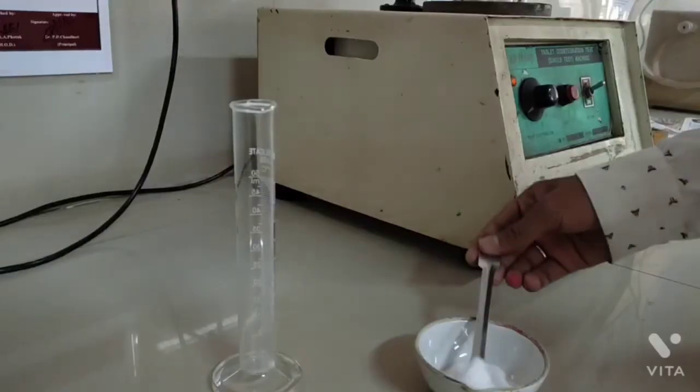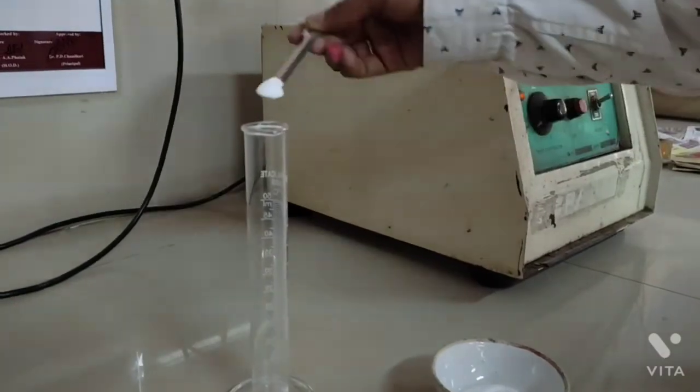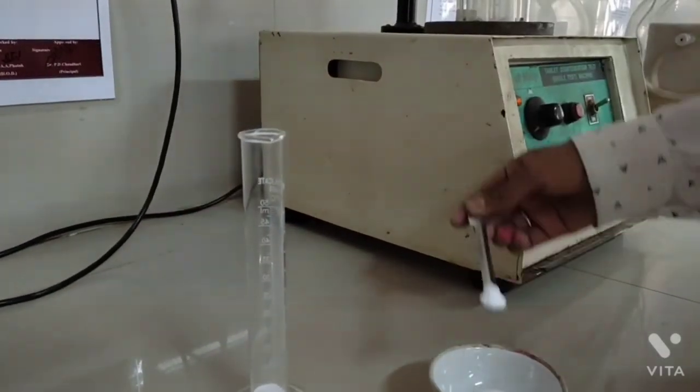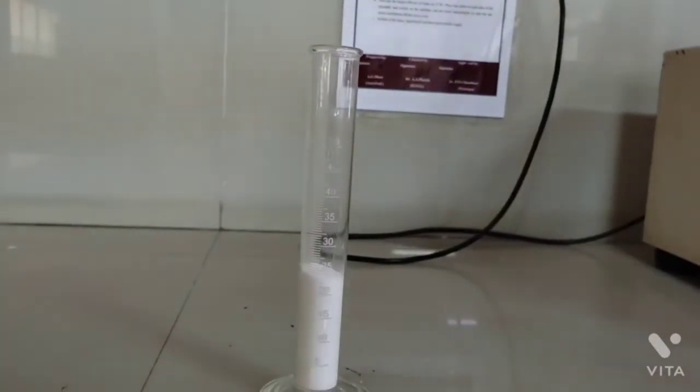Now let's move on to bulk density, tap density and compressibility factor of that powder. Add prepared powder in 50 ml measuring cylinder. Then mark the volume of powder.